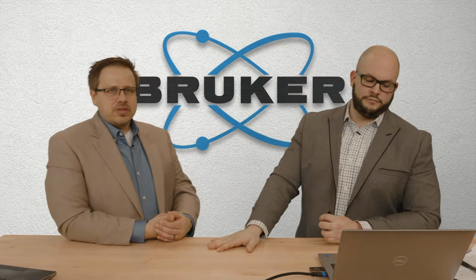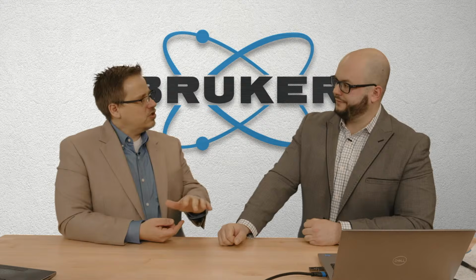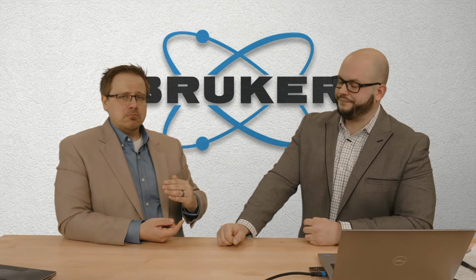Yeah. Generally what I do is I look for any ASTM standard. Look at what they're recommending, and then I'll go to DIFFRAC.EVA. In DIFFRAC.EVA, there's a tool called AbsorbX. In that software, you can type in the angle, the material, the radiation, and you can get an idea of the penetration depth. And we want to have a decent sampling. So look at that effect too, penetration depth.